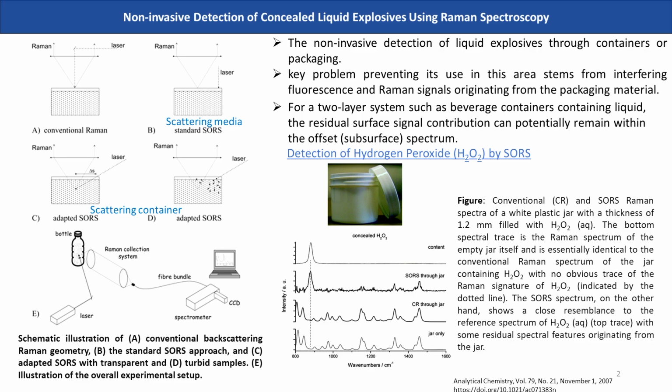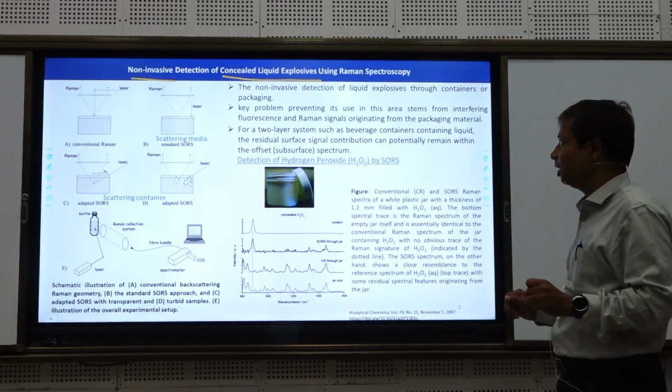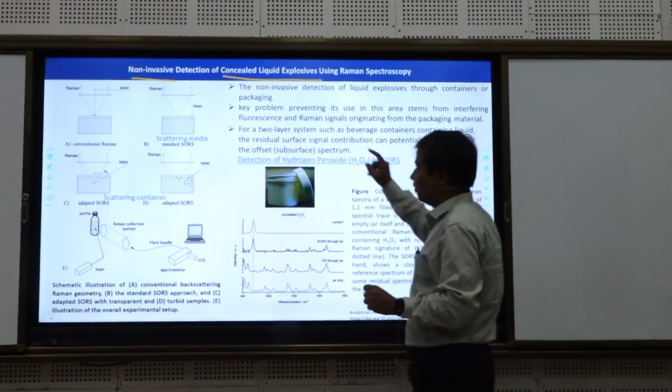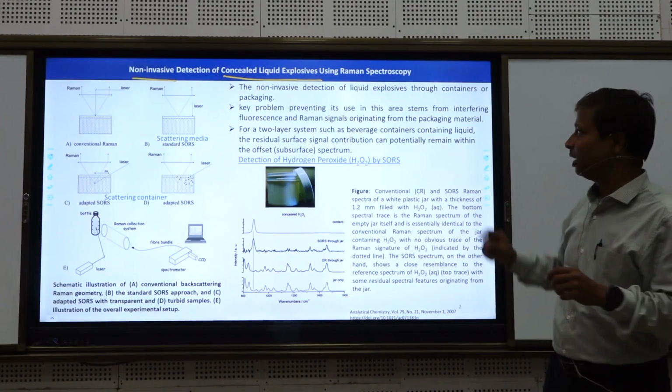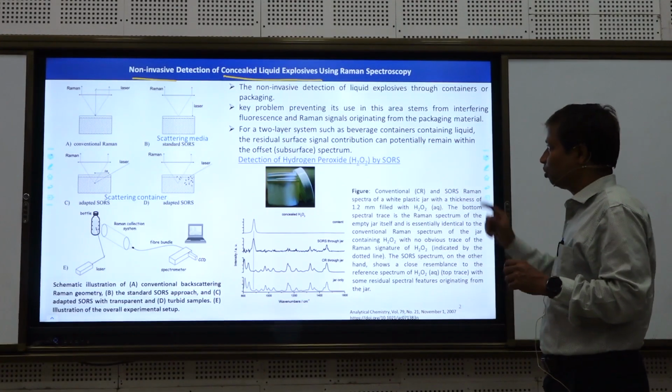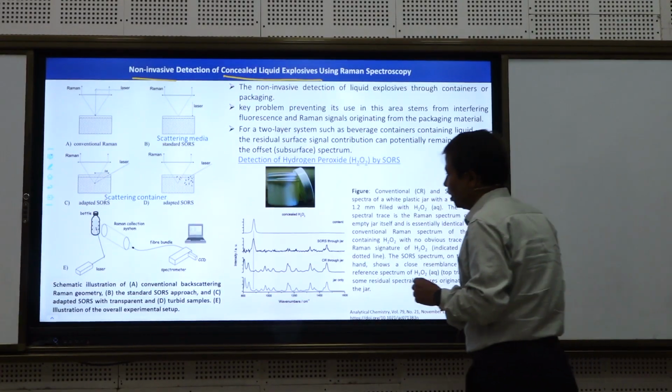Non-invasive means you don't have to do any kind of breaking or anything. You don't need to prepare the sample, and even if it is concealed, even if it is hidden, you can still find out. So non-invasive detection of concealed liquid explosive.